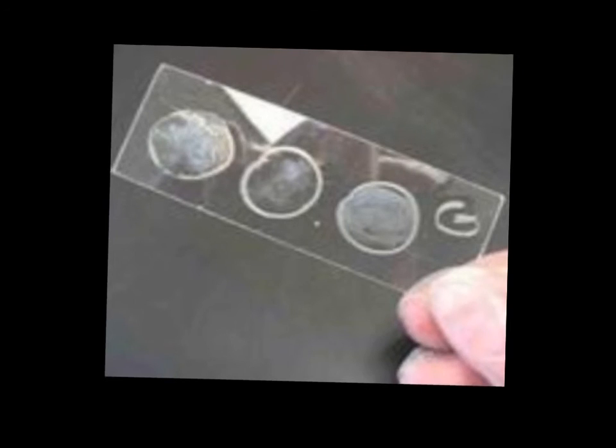And so finally, here we have our bacteria smears that have been heat fixed. We can see that they are present within the wax circles and they are ready to be stained.